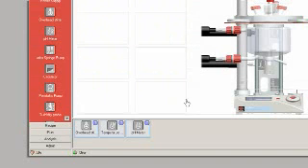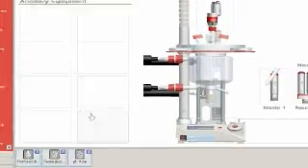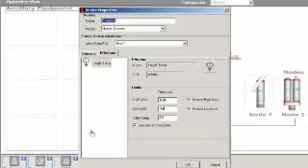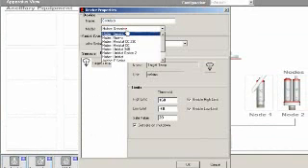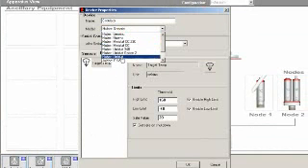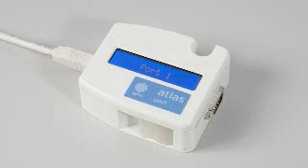In apparatus view, simply drag any apparatus to be used onto the main view. If other manufacturers' RS232 controlled apparatus is used, it is connected via an ATLAS port.